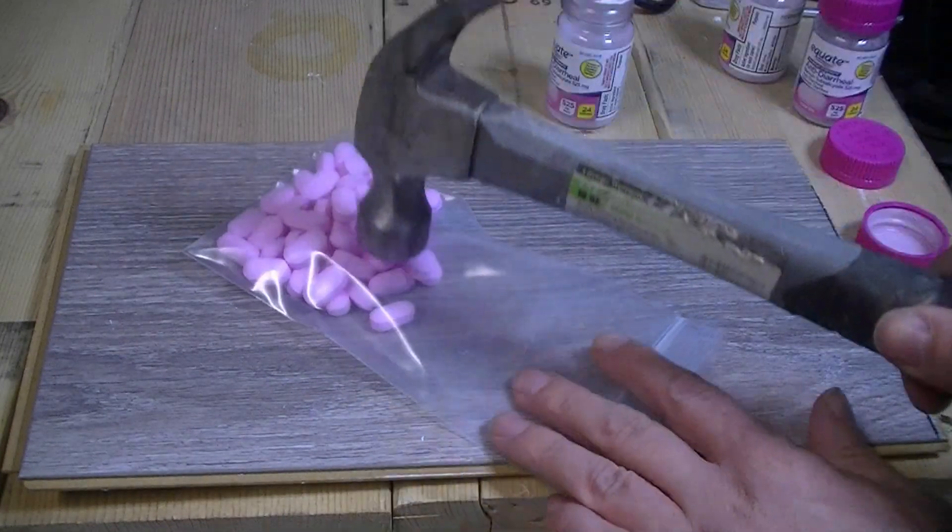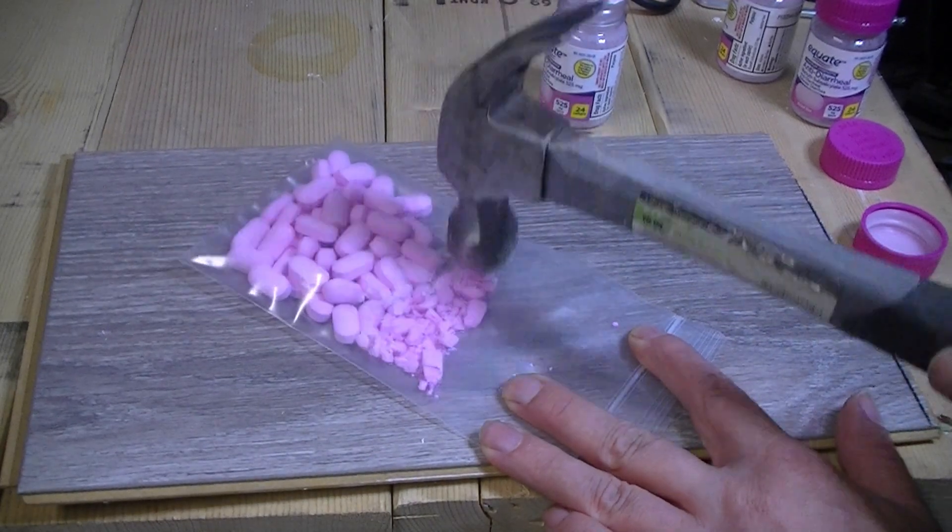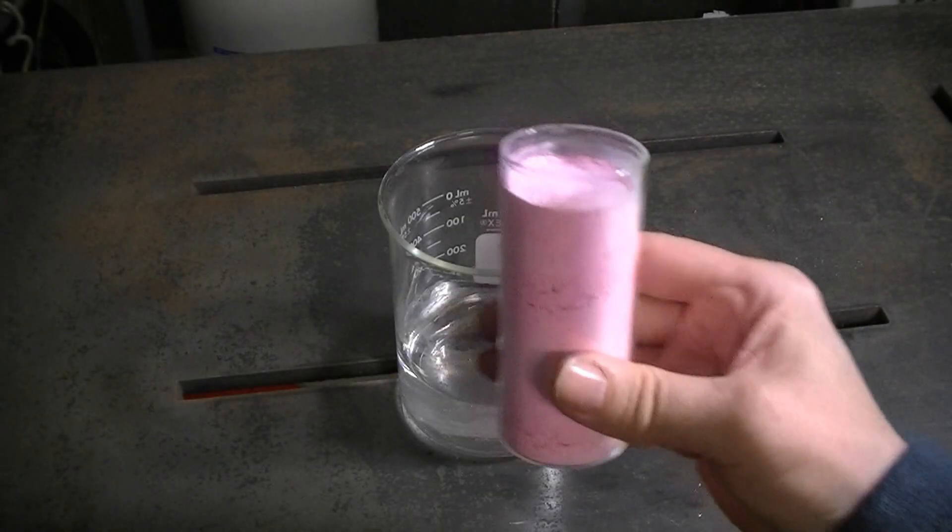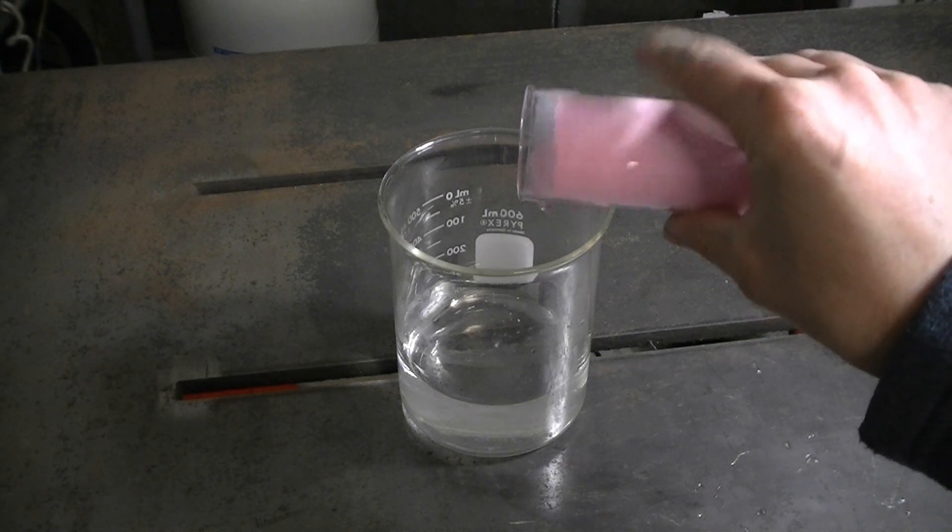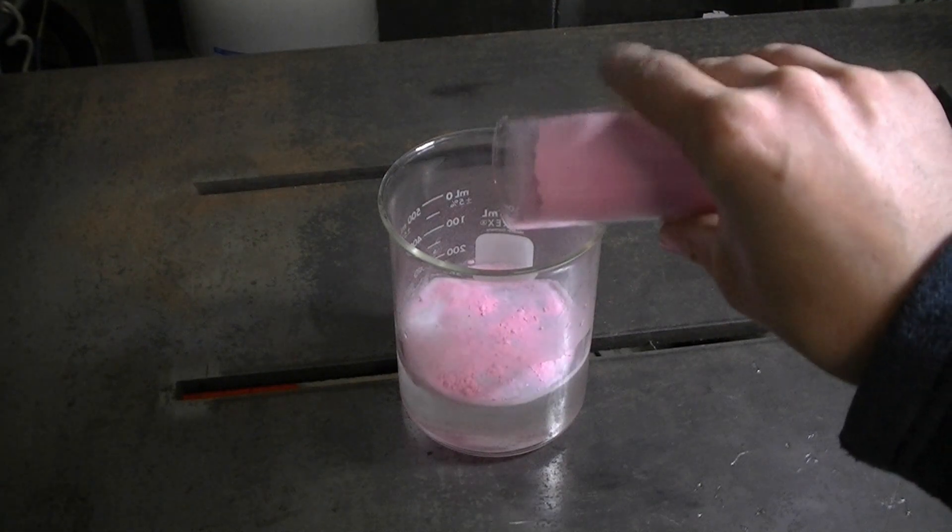So to start with, we break up our tablets to increase the surface area. We tap them with a hammer, this crushes them up. After we've crushed our tablets, the next stage is to add it to a beaker containing muriatic acid. This is basically hydrochloric acid. Muriatic acid is used to clean concrete and is commonly available.